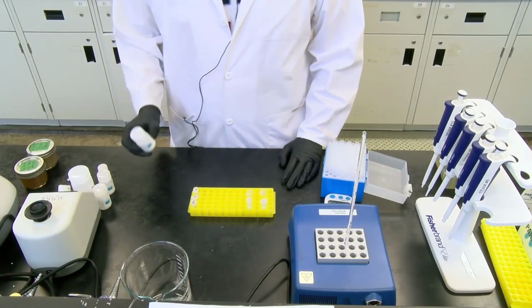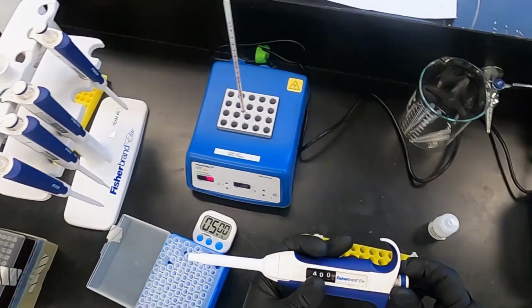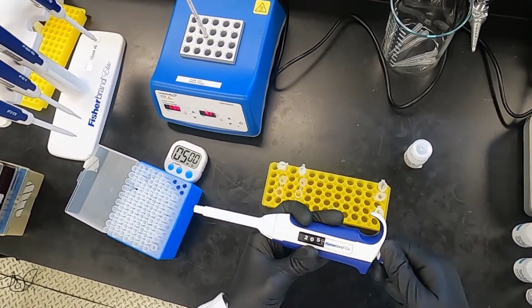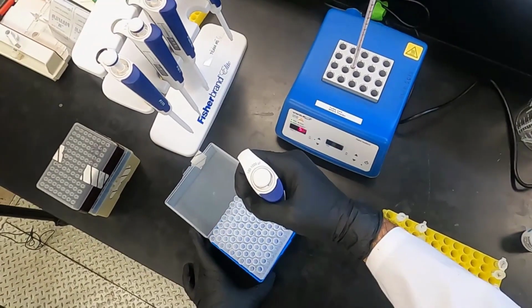So the first step is you're going to add solution DS to your Eppendorf tubes. You're going to want to add 200 microliters, so set your pipetter to 200 microliters. You want to add them stepwise like we've been doing.